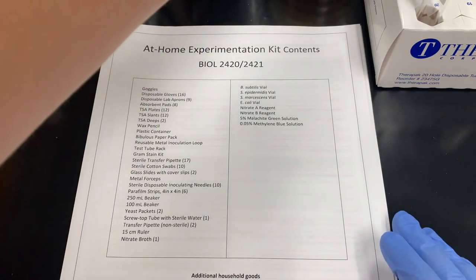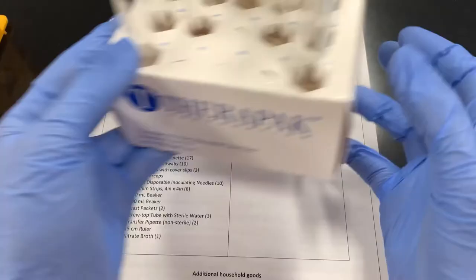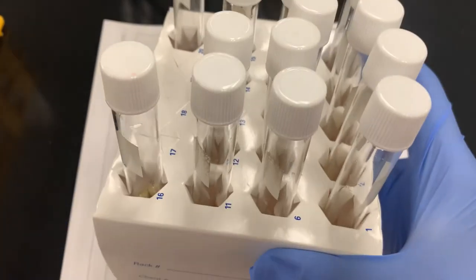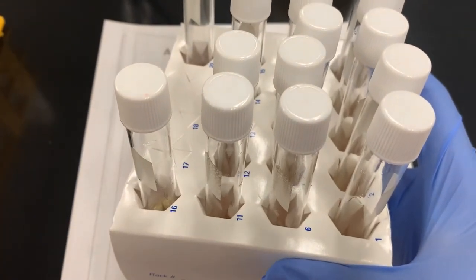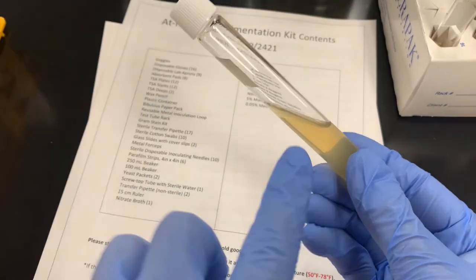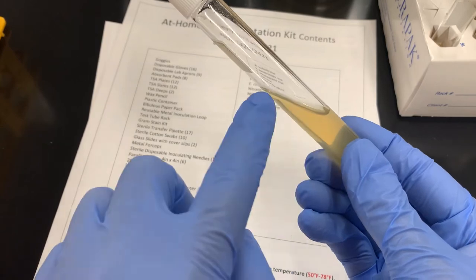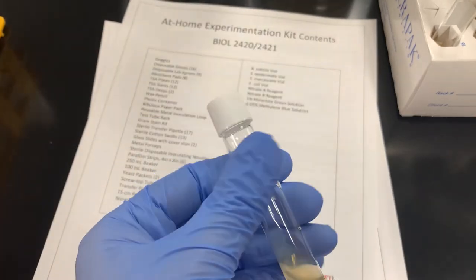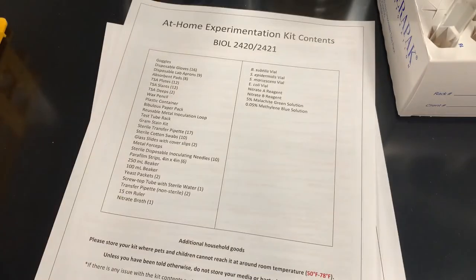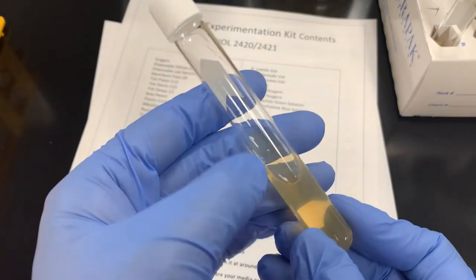Next, we're going to go with TSA slants. Now your slants, your deep, your water and your nitrate are going to come in this disposable test tube rack. Okay, sorry for the shakiness. You're going to find 12 of these slants. They are called slants because the agar slants inside the test tube. These are screw top tubes. They are currently sterile. Okay, once you open this, it won't be sterile. However, we have ways around that so that you can grow your bacteria inside.